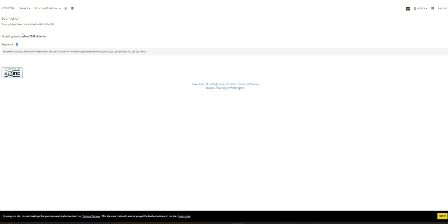Okay, so our job has been submitted with this ID, and the modeling method is Rosetta Fold, and our sequence is also here. Okay, so this takes some time to process and give our model, so we can wait.